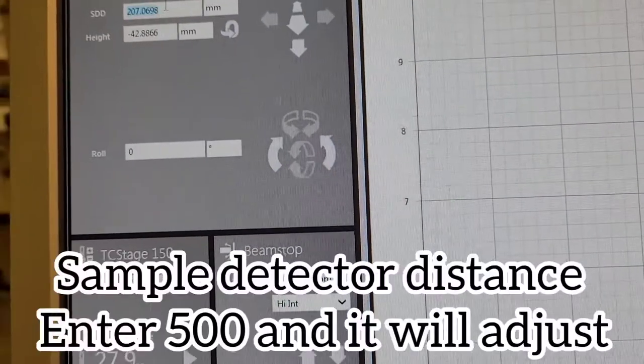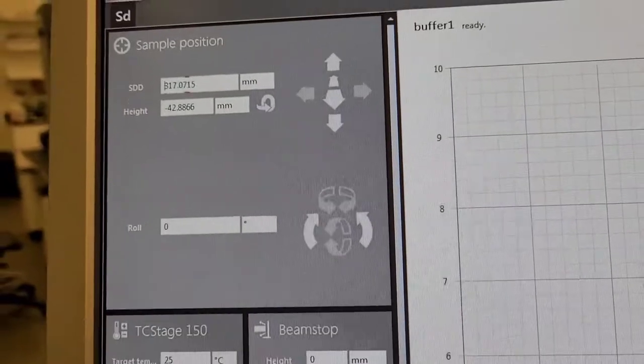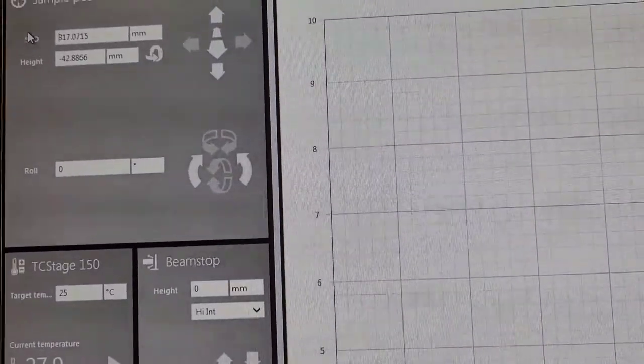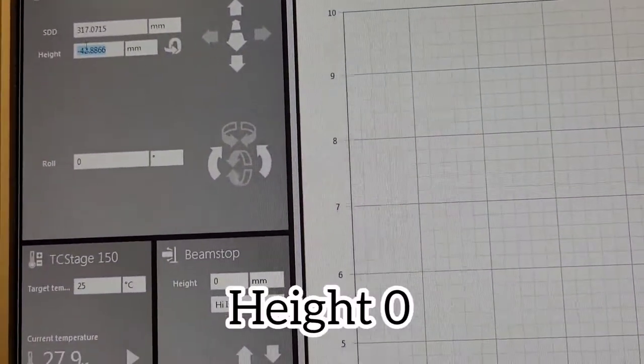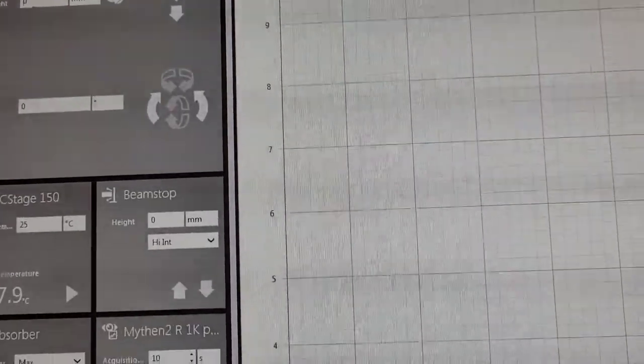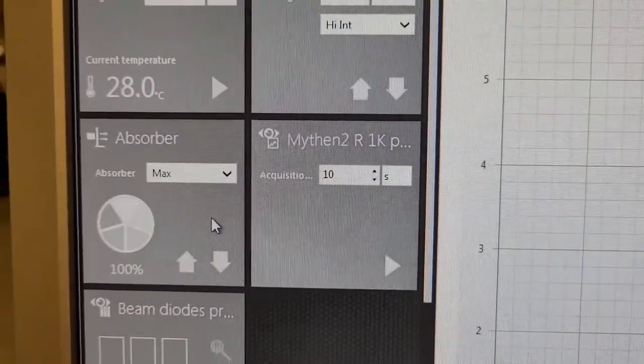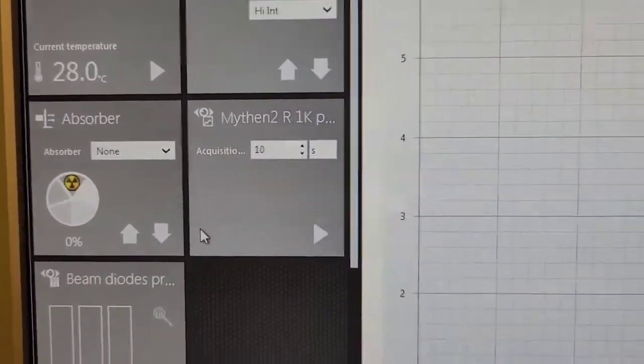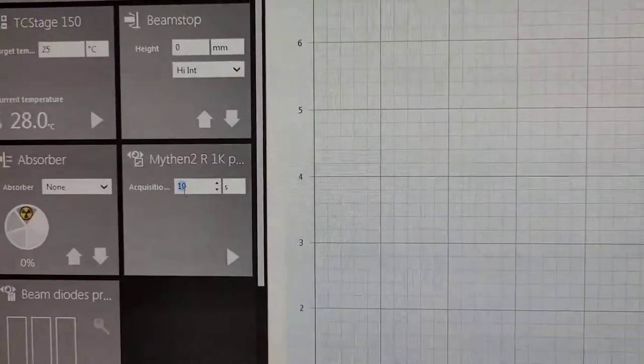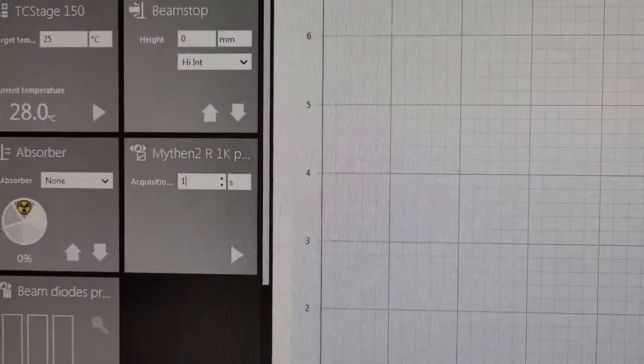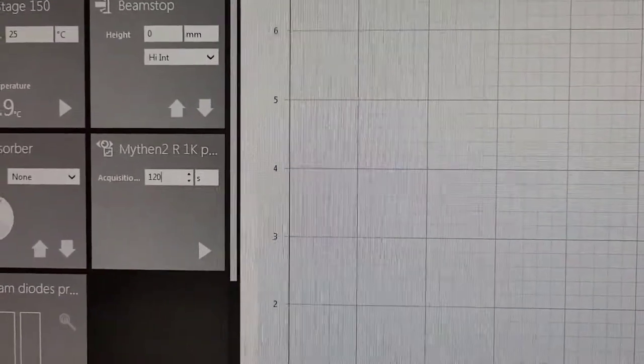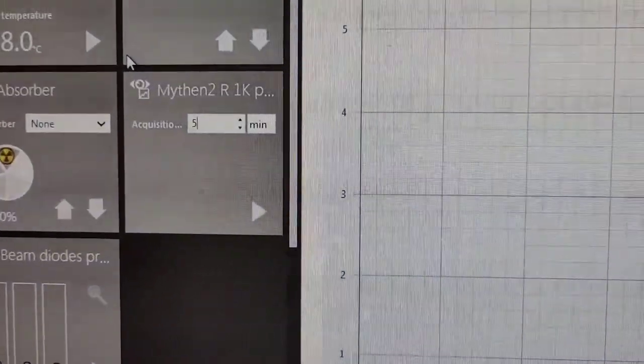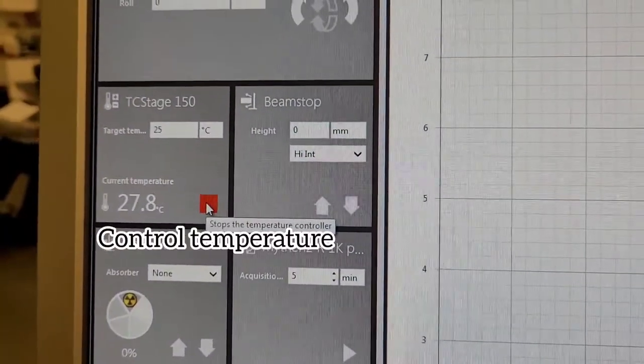I can start acquiring data from my buffer. Here we have a sample detector distance value. I put 500 and it goes to the 317 point something which is what it should be, but because I can't remember that number I put 500. Everything else - height and roll is 0, absorber none, beam stop high intensity setting. At this point I'm going to do a test measurement. I'm going to put the time that I want for the test run, something small like 5 minutes.